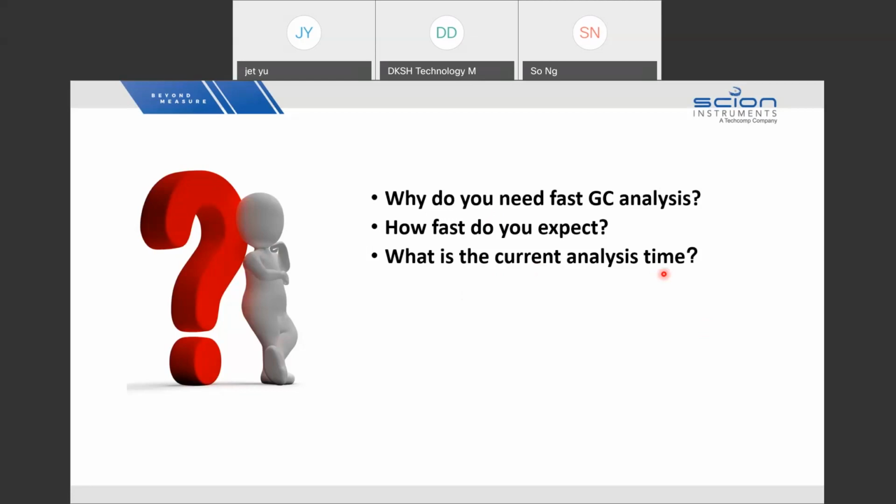For example, you already have a GC analysis method with 60 minutes. Yeah, 60 minutes is, to me, pretty long for separation techniques. All right, so 60 minutes. Your working hours are 8 hours. Okay, or some of you may work overnight, or may just stay late in the lab. Anyhow, let's say 10 hours, including lunchtime, whatever.